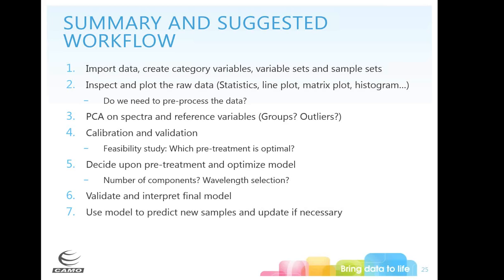And keep in mind that once you build a model, it's not a static entity. It has a life cycle. Depending on your process, you may want to reevaluate it in 3 months. You may find that it stays stable for a long time, and you only recheck it every year or so. So that's something that you need to think about in your plan when you implement these things.